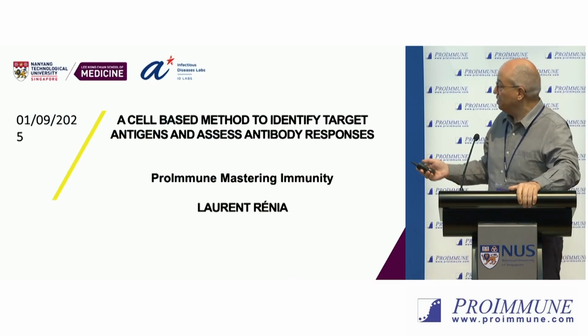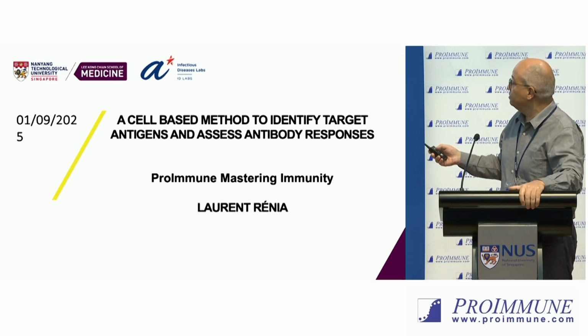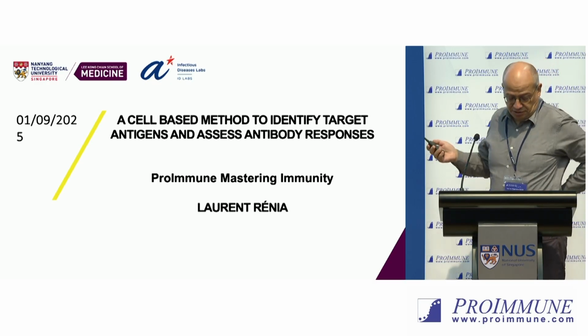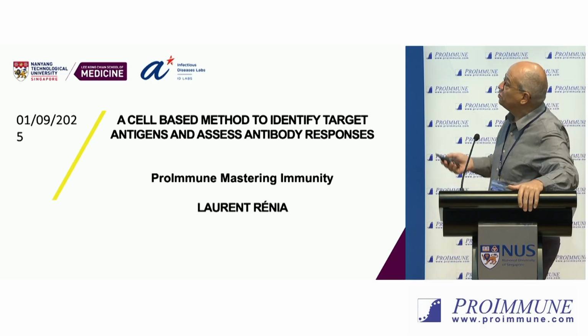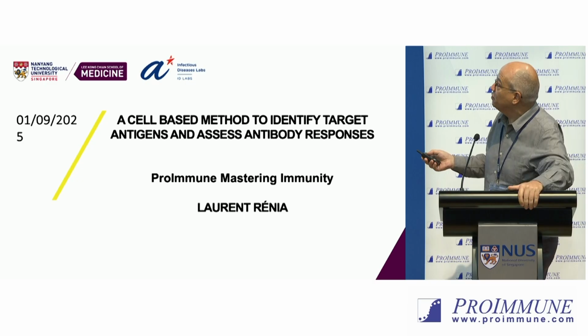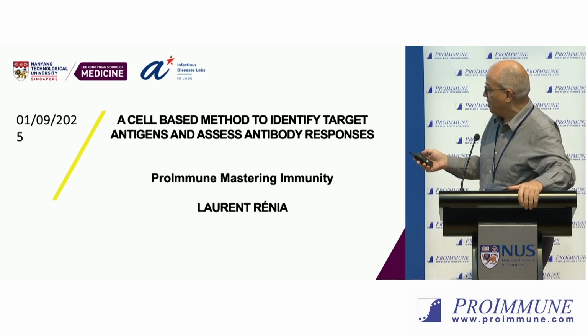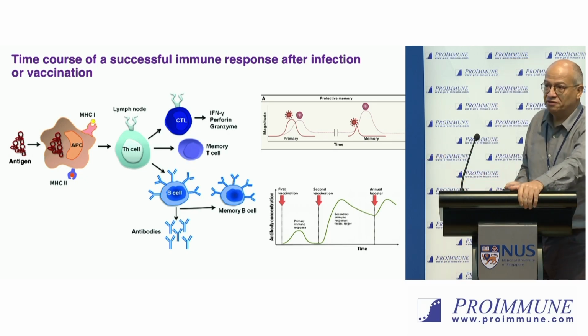So I will go a bit more immunology in my 15 minutes presentation, and less high-flying. I will talk about a cell-based method to measure antibody that we developed in the lab, and in fact it was a technique that we repurposed from malaria and applied for COVID, and we are expanding to other diseases now. So a bit of immunology 101.